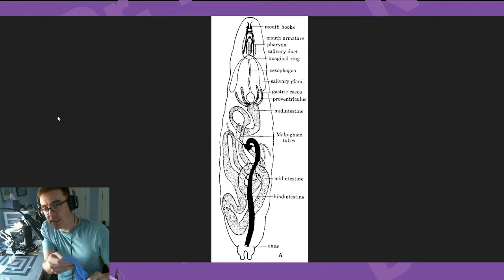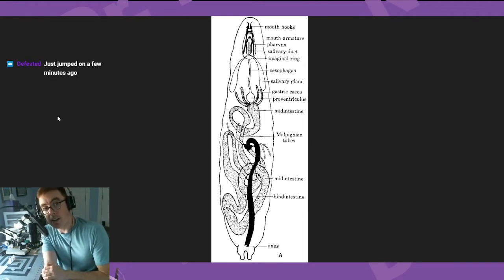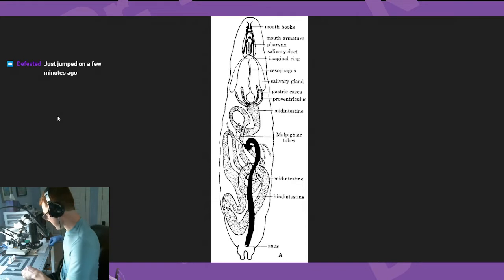Anyways, Defested. I don't know how long you've been on, but I'm doing some dissections of fruit fly larvae, one of which is on screen right now, or a cartoon of it. I'm grabbing out a special organ that has a lot of DNA in it. I'm hoping that we can actually see some of that DNA with my microscope. Great, so I see you joined a couple minutes ago. We'll actually see if this works.